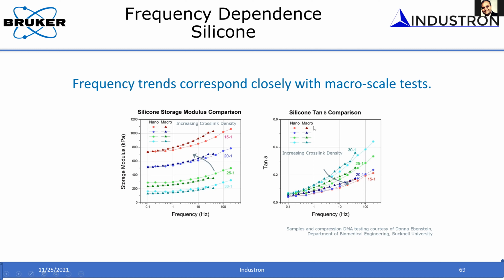And to do that, we went up to almost a micron scale, because at true nano scale, the properties of materials may be different. So we went up to a micron scale, measured the mechanical response, and compared that to macro scale. So even at micron scale, we were able to match the macro scale properties.